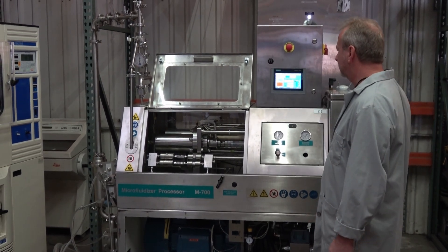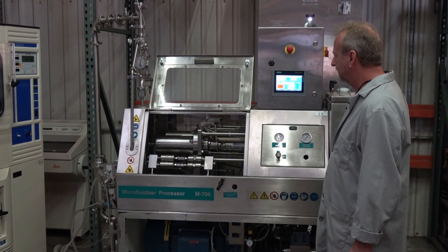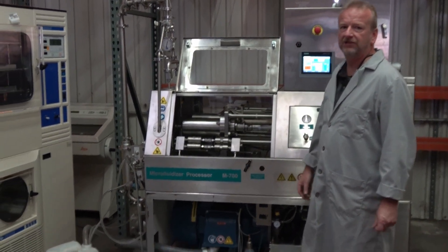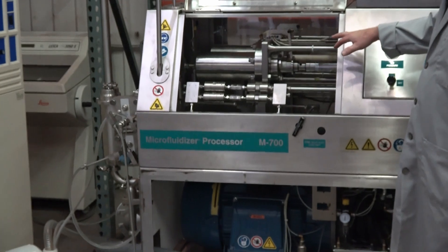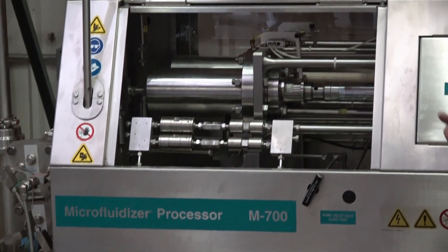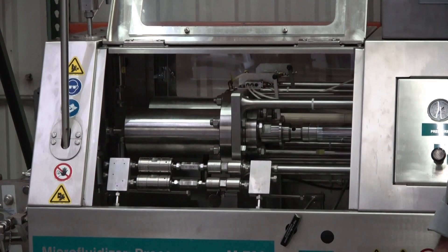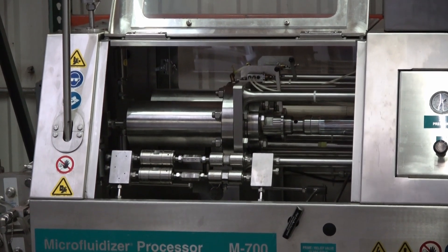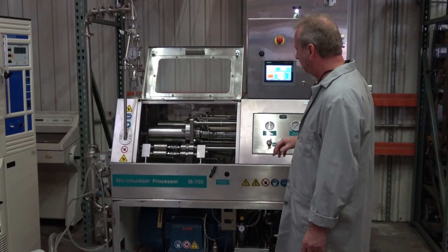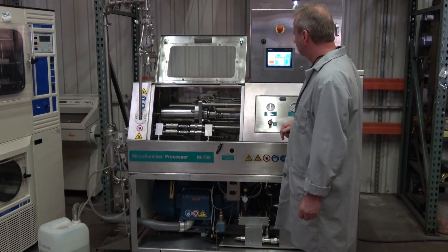This is an AM 7250, which means it has two cylinders in it, and it's actually the 20,000 psi unit. We're going to start it up and run it. I just left some of the panels off for the video so you can see inside it.